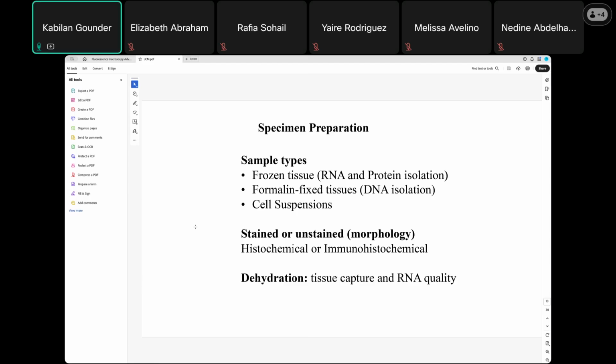All the process up to staining is the same, either for light microscopy or fluorescence microscopy. After you place them on the stage, your choice is whether you just want to see the structure or expression, then you cover them with a cover slip and seal them to protect from dust or drying.